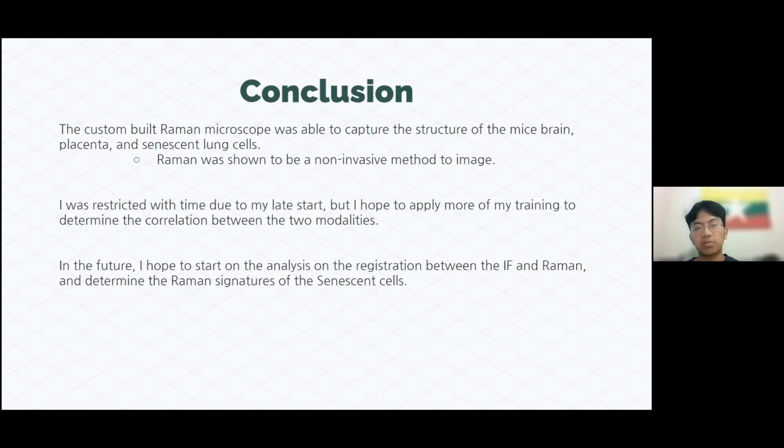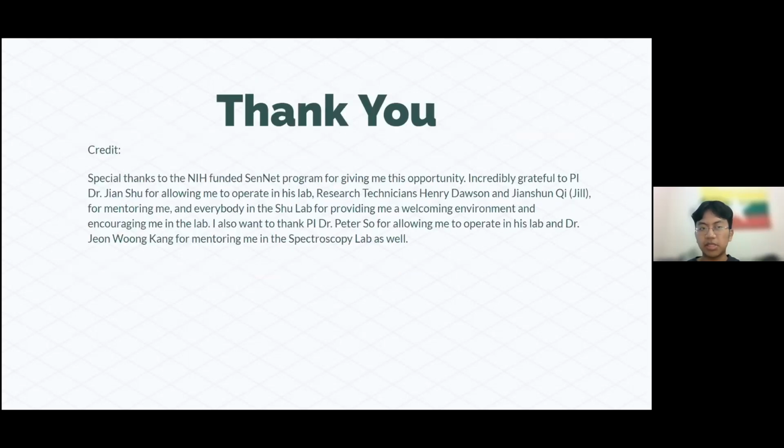And so I hope in the future to determine the correlation between the two modalities and also start analyzing the registration between the IF and the Raman images. And hopefully in the future, I can determine the Raman signatures of senescent cells on my own and without help from my respective PIs.